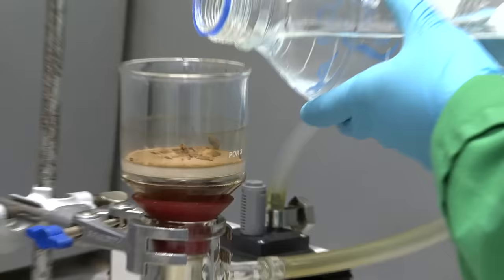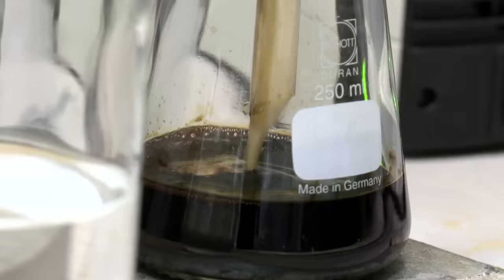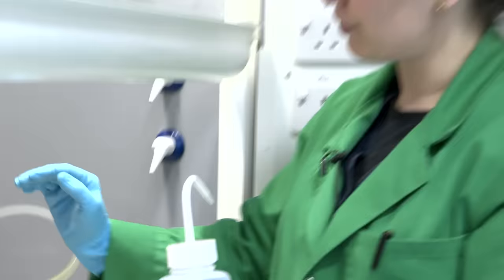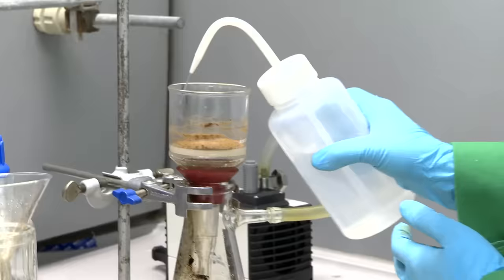We're washing away some of these impurities, some of the byproducts that are formed during the reaction or unreacted starting material. And then I'm going to repeat this washing procedure with diethyl ether. Diethyl ether is an organic solvent, so similar to how we've just removed any water soluble impurities, we will now remove any impurities that are soluble in organic solvents. And then the hope is that by the end of this procedure, we'll have nice pure thalidomide remaining.